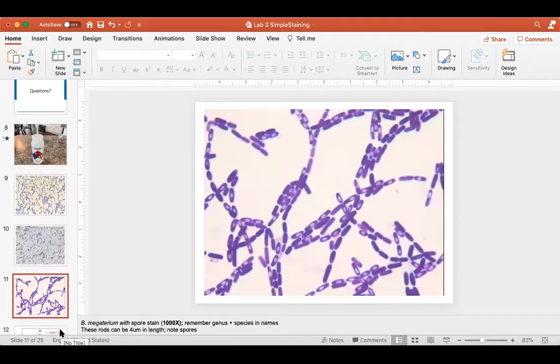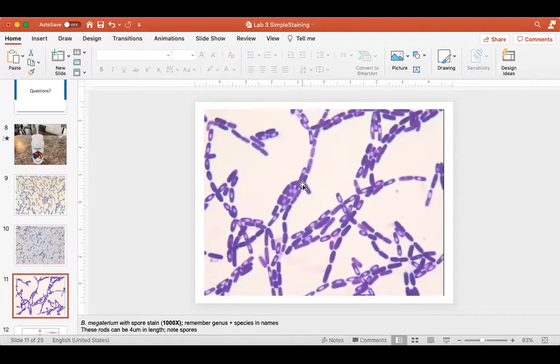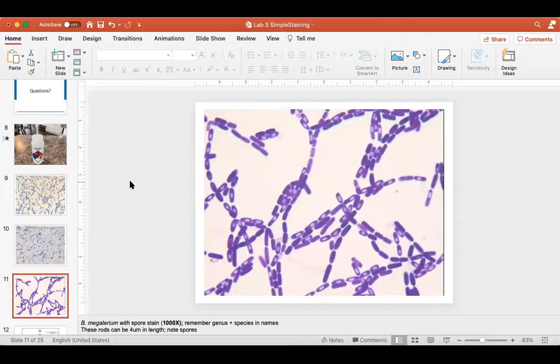This is a different organism under the same 100x magnification at 1000x total. Look at how big the cells are compared to those. This is also a Bacillus organism — Bacillus megaterium. The mega part really makes sense: this is an enormous bacterium. These rods are about four to maybe five or six micrometers in length, which is pretty big for a bacterial cell.